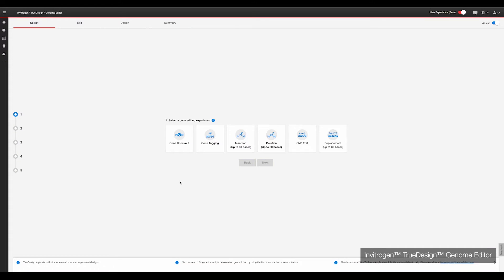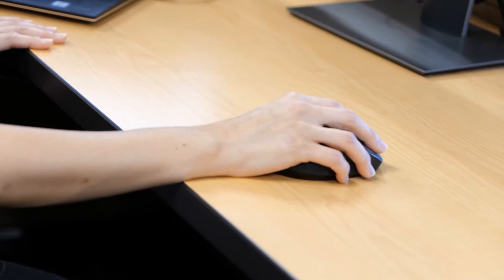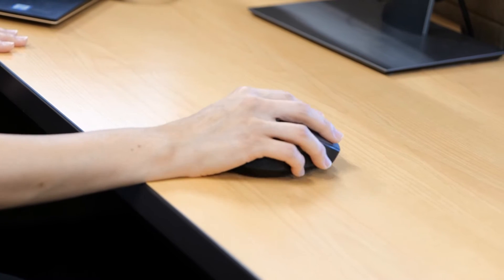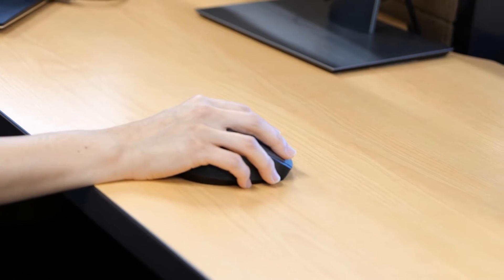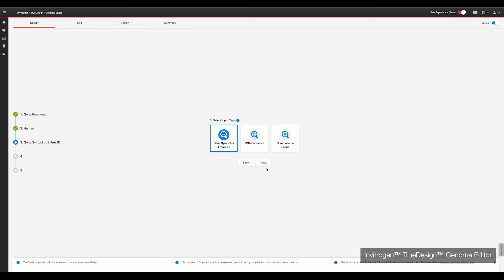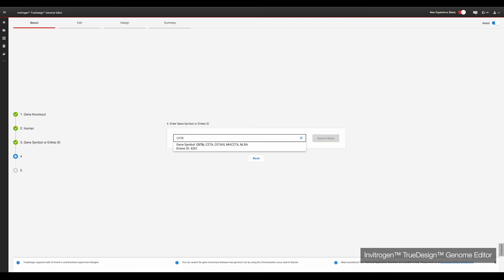The first step is to design the experiment and order the required reagents via the free Invitrogen TrueDesign Genome Editor software. For today's experiment, select Gene Knockout, select the species of cells — in this case human — and then search for the gene of interest, in this case C2TA.